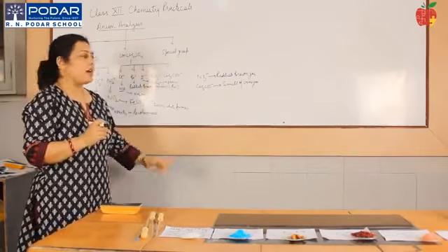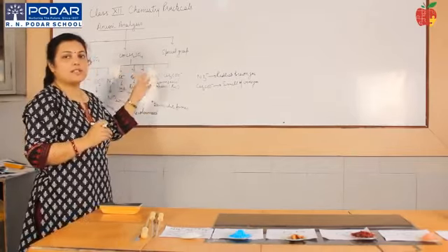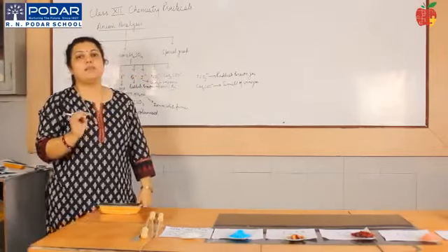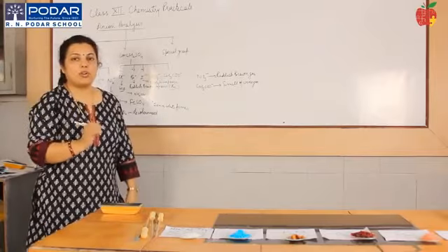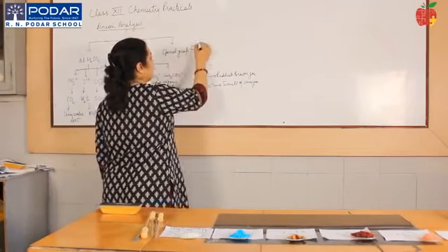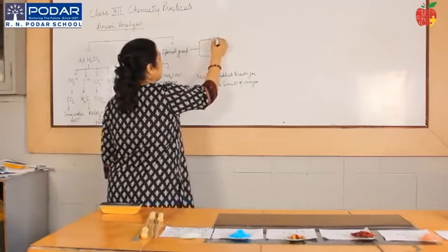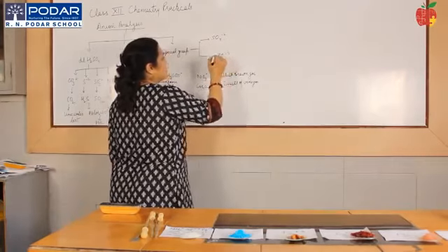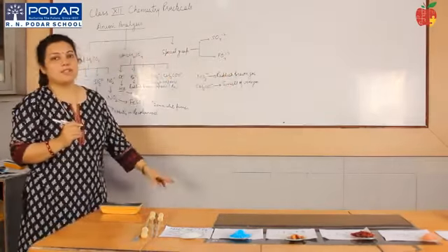Okay, so this is regarding your second group, which is your concentrated sulfuric acid group. Salts which cannot be decomposed easily by your dilute H2SO4 or concentrated H2SO4 are present in your special group. So in your special group, you have two anions, which is your sulfate and your phosphate. There are no special or preliminary tests for these two.